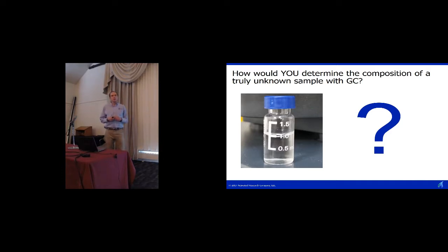Okay, so how would you know the calibration factors between each of the different compounds? Don't know the calibration. Okay, so you just approximate it with a mass spec. Okay, so one solution. Any other approaches that people would take? Has anyone used the calibration standard? Nobody? Has anyone purchased a calibration standard and then run that on the system?